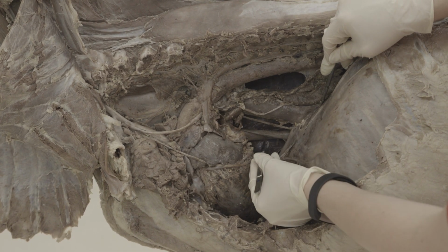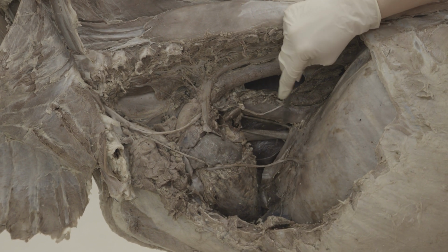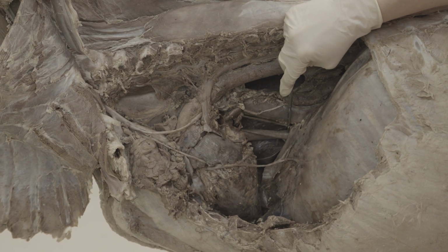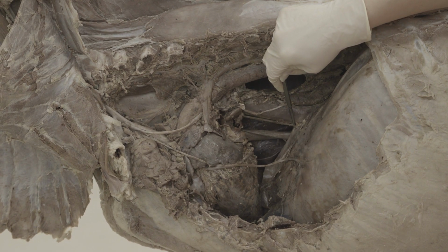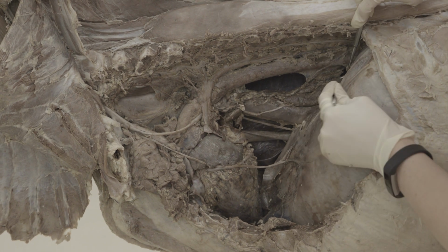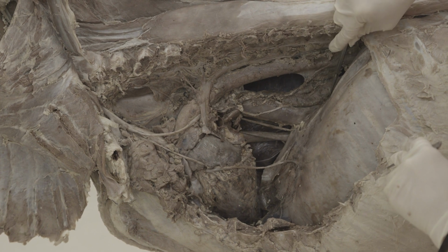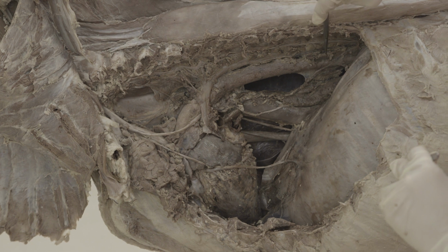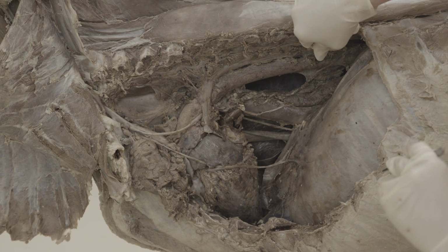Here from this side you can see the caudal vena cava right here. After you remove the right lung, you'll see it better because you have to move the accessory lobe on the right lung to see it. The caudal vena cava runs through the caval foramen in the diaphragm there. And here on either side of the esophageal hiatus, you have a crus, that muscular part that we saw. We'll take a closer look at that a little bit later. And then your aorta here is running down and will go through the aortic hiatus, which is way down inside.